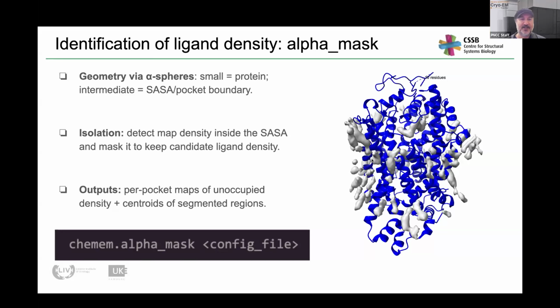So I'll throw in a personal question. You mentioned early on that one can incorporate information from other techniques. How is this done effectively? So let's say one has NMR data, maybe NOEs are giving some kind of distance restraints, or RDCs are giving some kind of angular restraints. Are those imported in just as harmonic restraints, or is it something more sophisticated than that?